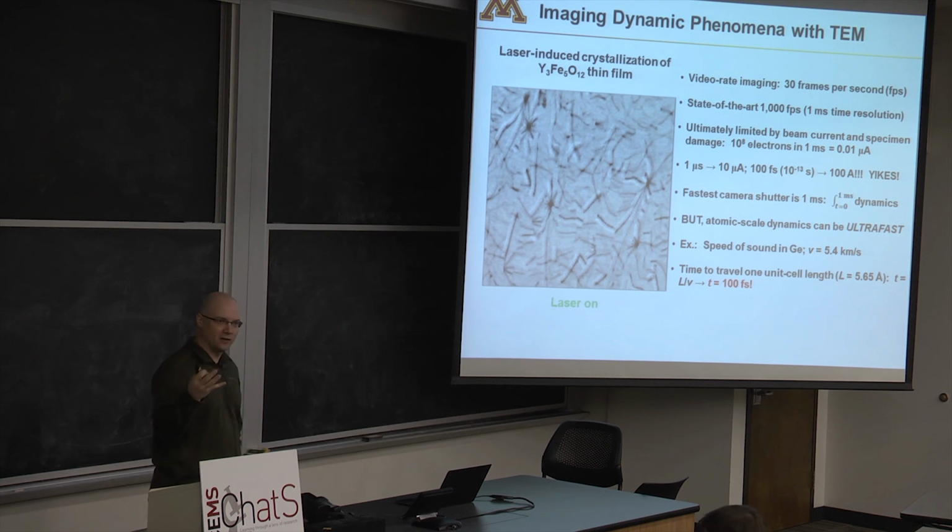So you've probably heard very generally that certain sorts of diffusionless transformations in materials, the atoms aren't actually having to diffuse and move through the material. It's a diffusionless process, and you've probably heard this happens at the speed of sound, more or less. So this is what we're dealing with. This is what we're talking about. If I want to see a diffusionless process occur at the unit cell scale, these are the time scales I'm going to need.